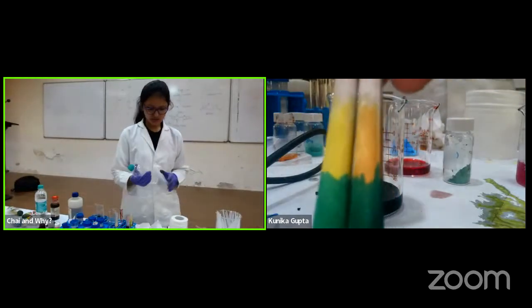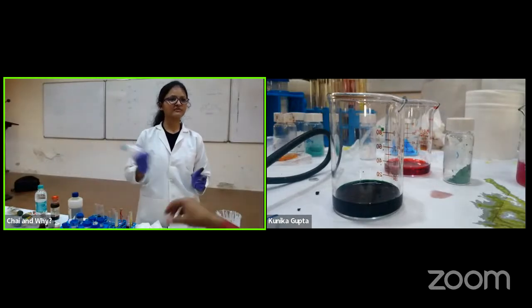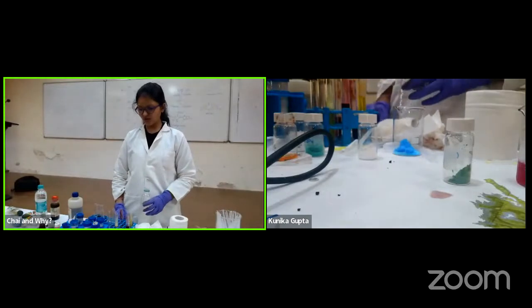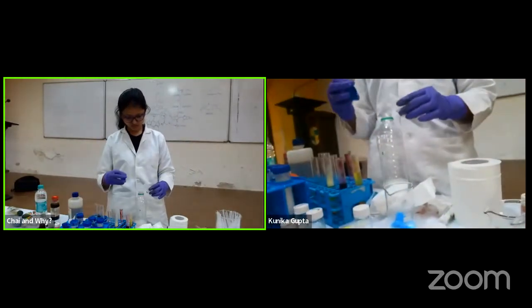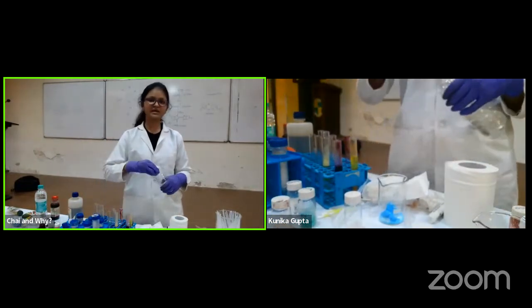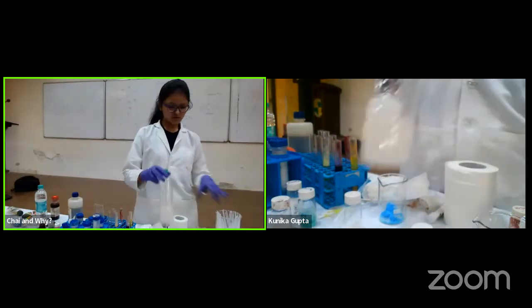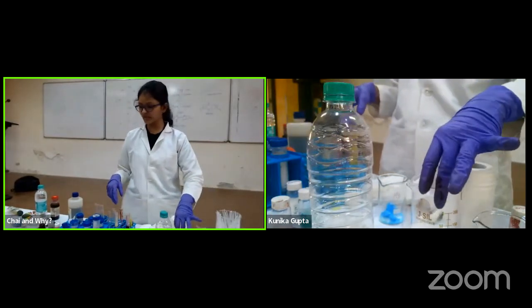Okay. So coming to this experiment, where I have just made a glucon-D solution, now what I will do is add sodium hydroxide to it. So I have a solution, I use that. Now this is a basic glucon-D solution. To the other beaker, I'll add something known as methylene blue.